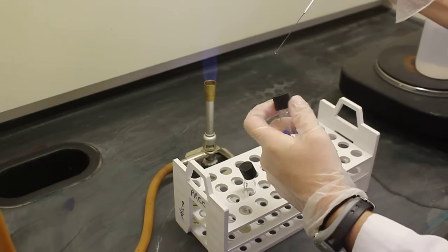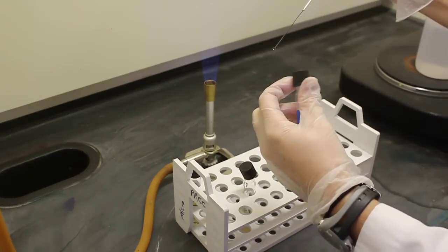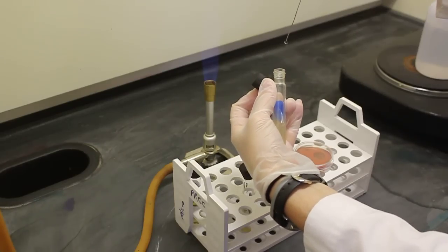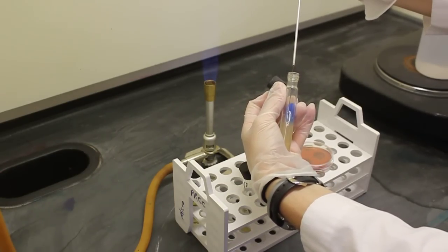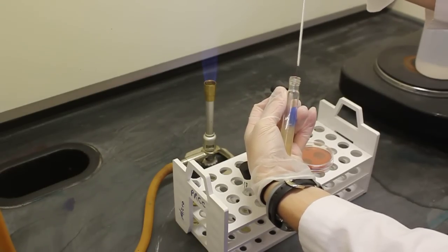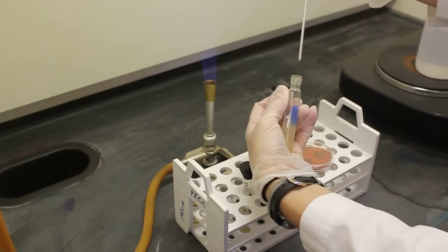I am now going to inoculate the slant. For solid media, you only put the bacteria on the top. I go to the bottom of the slant and just rub the loop onto the slant.